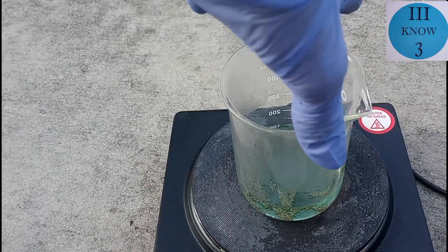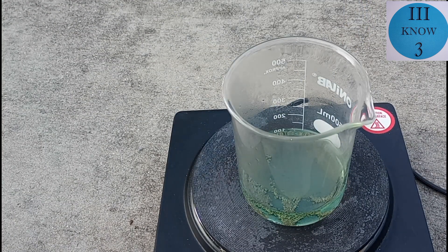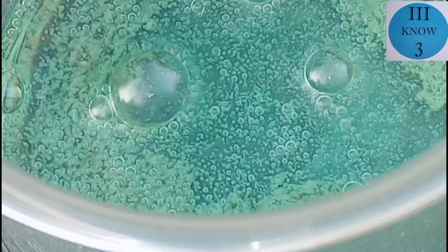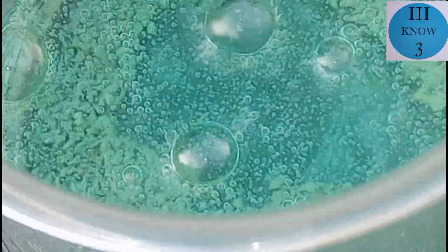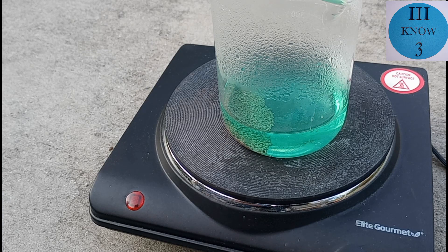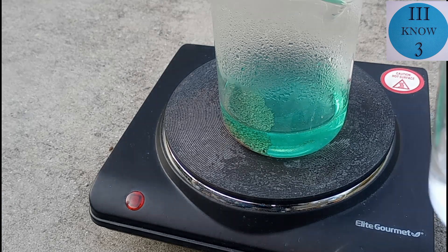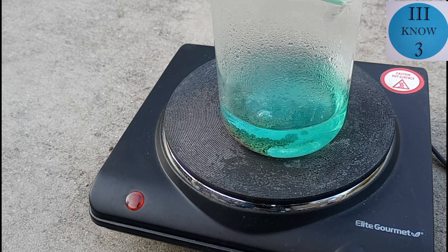You can see the almost instant color change from clear to a pale blue-green. There is a vigorous reaction taking place as the copper and probably zinc is getting dissolved into the solution. The reaction started slowing down so we added another about 40 milliliters of acid to the solution and an equal amount of hydrogen peroxide.